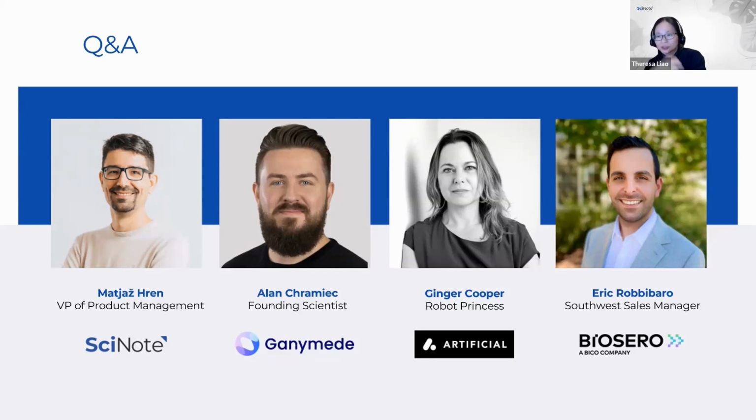I also feel like automation actually also helped this process because we say that humans are important, but at the same time, some of the automated processes make sure that you prevent some of the more errors that can happen during the transition from one platform or one source to another, right? Does anyone else have anything you would like to add? Feel free to unmute yourself. I mean, this is our last question, so anyone else have anything to add here when it comes to using automation solutions in the regulated environment? Matjaž kind of summarizes everything for you all.